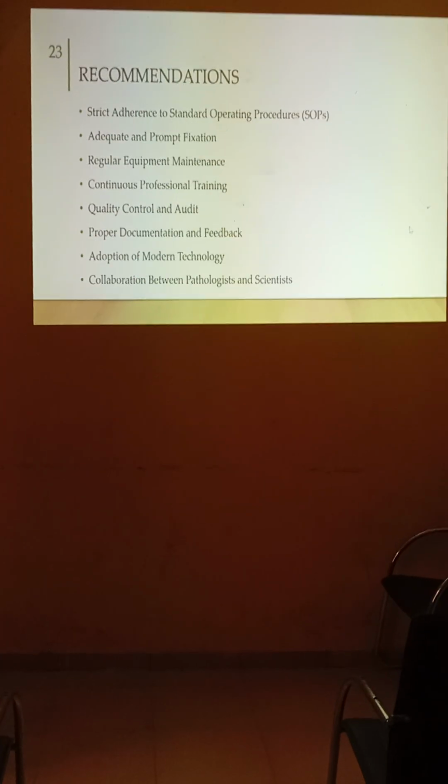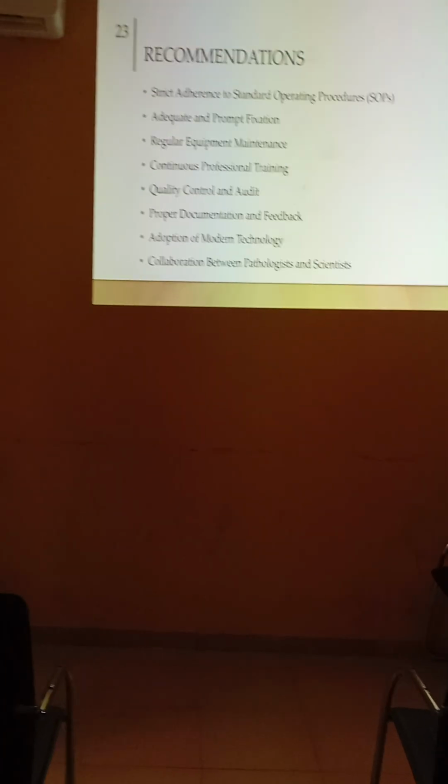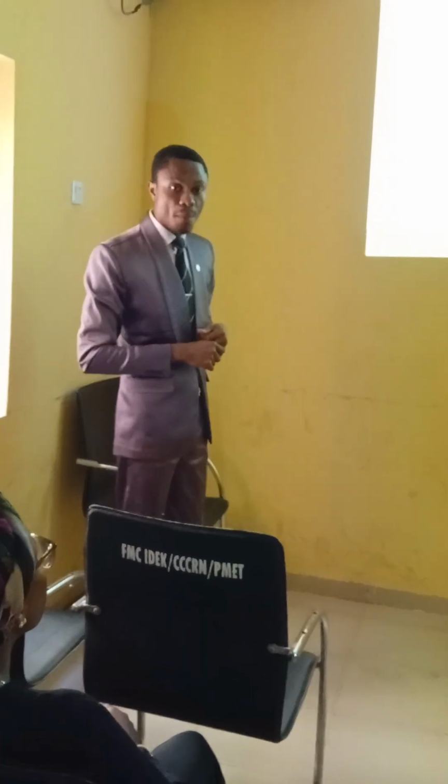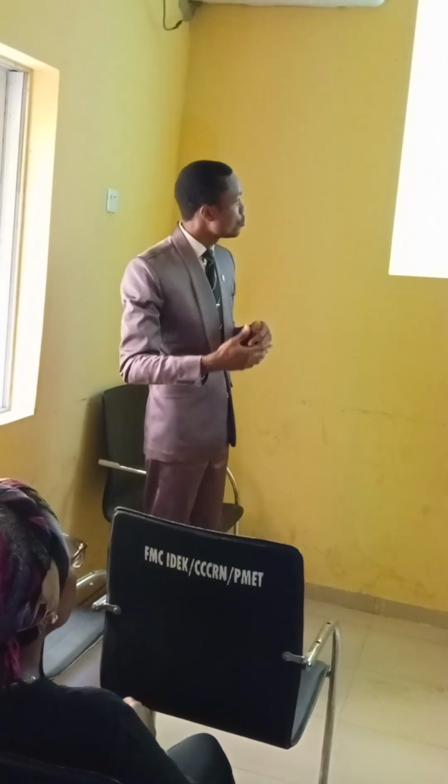Also, my recommendations. There should be strict adherence to standard operating procedures, since we have seen that if these things are not done, it can introduce artifacts. Then adequate and prompt fixation is very, very important. There should be regular equipment maintenance, especially in terms of the microtomy, because any change in the clearance angle or maybe a blunt knife can introduce artifacts.